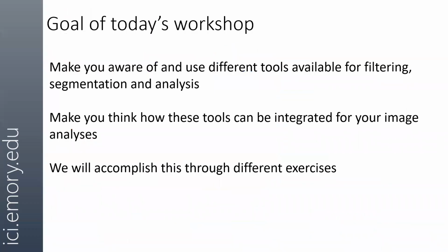All right, so the goal of today's workshop, we're going to cover different types of filters. We're going to apply them. We're going to go over what mechanically a filter is when it's manipulating an image and working with pixels. This is just going to be a touch on the more mathematics side of data analysis. I will not ask you to do any math. Don't worry, this is not a maths class.